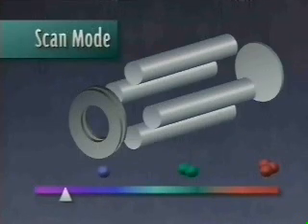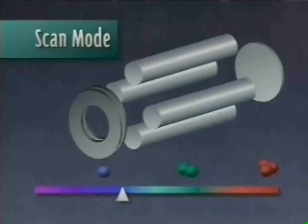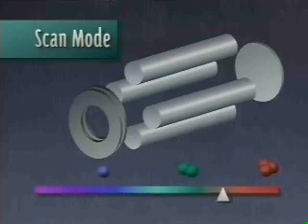In scan mode, the mass filter is set to sequentially operate through a range of masses. It has lower sensitivity because most of the ions strike the rods during the scan. For general unknowns, the selected mass may initially be at 100, then 101, then 102, and so on. This is used to generate spectra for interpretation or a library search.